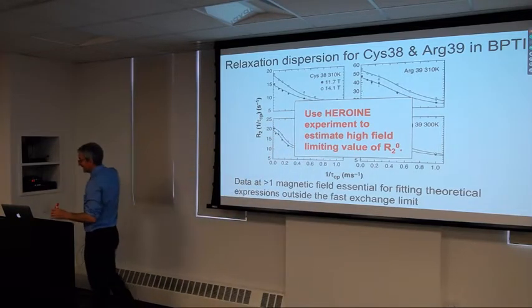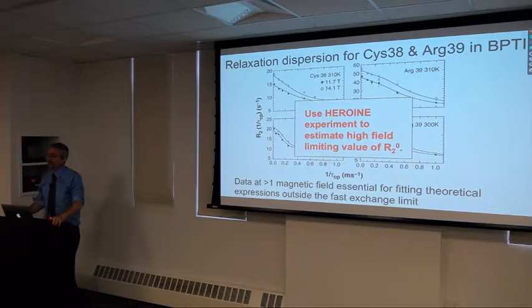We generally try to keep the duty cycle at less than 10%, so that the length of the RF pulses are only 10% of the total time period during the CPMG. That's both for heating effects, but also the theory doesn't really take into account relaxation effects during the pulse. So if the pulse became a large fraction of the total time, we would have to worry in a serious way about relaxation effects during the pulse.